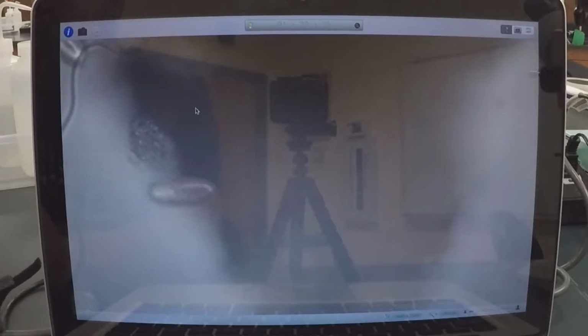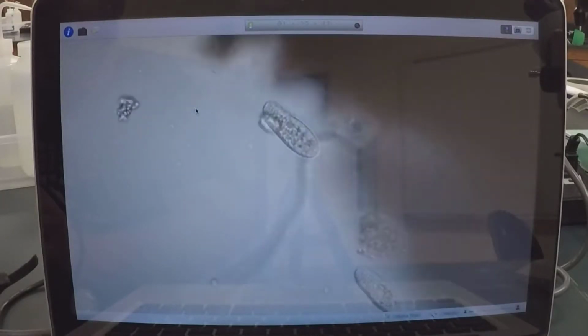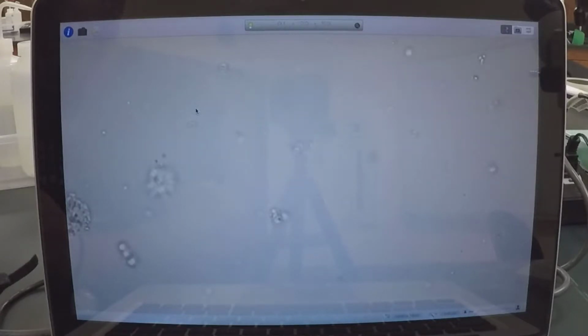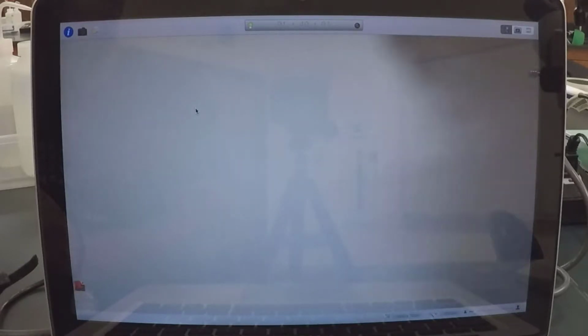And to examine these, you can see some paramecium here, quite a few sitting there, some buzzing through, some stuck in the algae. There's quite a bit of diversity here. Mainly paramecium, but again, quite a few varieties of things.